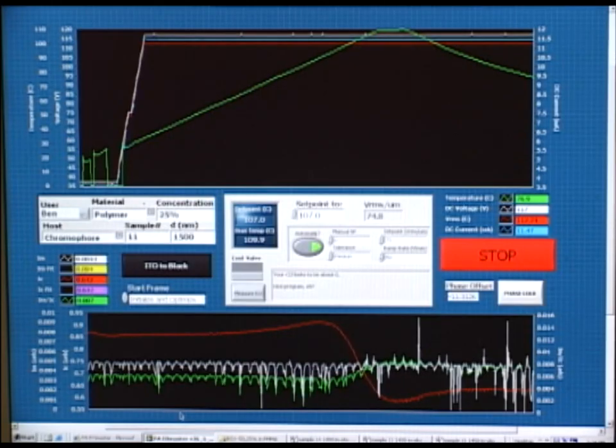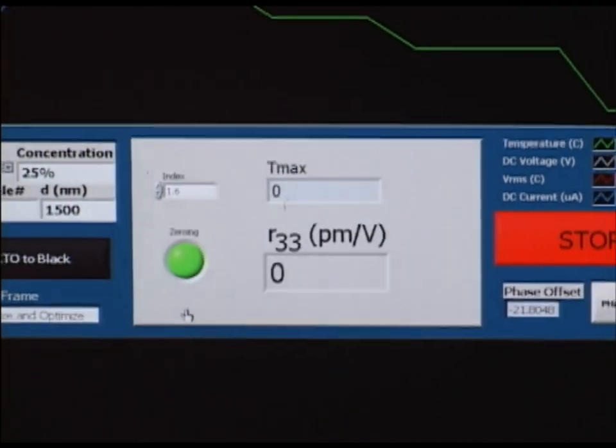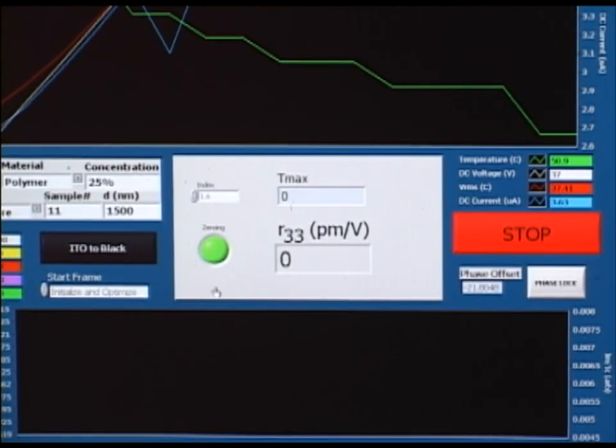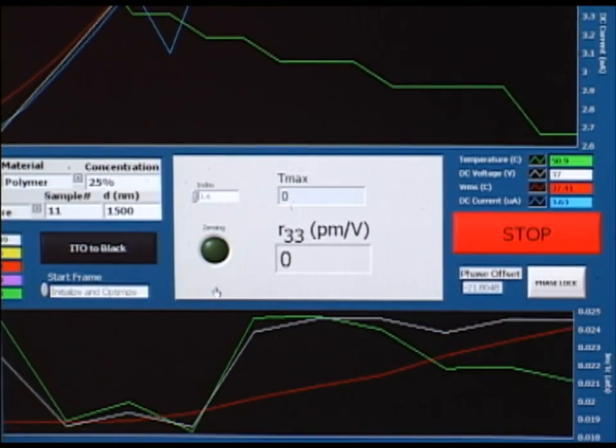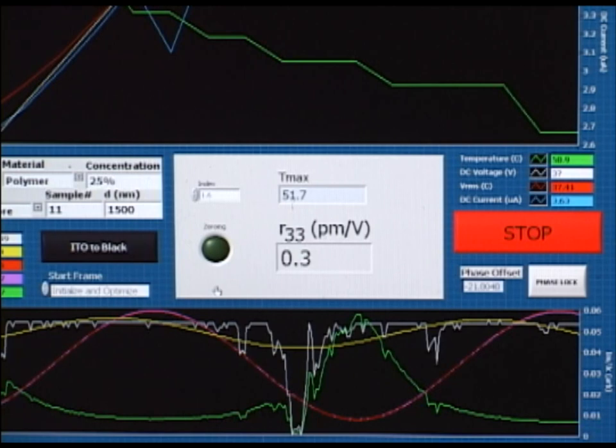Once the sample has cooled sufficiently the DC voltage is removed from the sample and the computer will then begin measuring the R33 by rotating the compensator. This can also be performed at any point by clicking the measure EO button. The machine is now zeroing the compensator and rotating it, which is shown by the change in the total light incident on the photodiode, which is the red line. Once the compensator has completed a full rotation the program will use its fitting routines to calculate an R33 which is reported in this box.